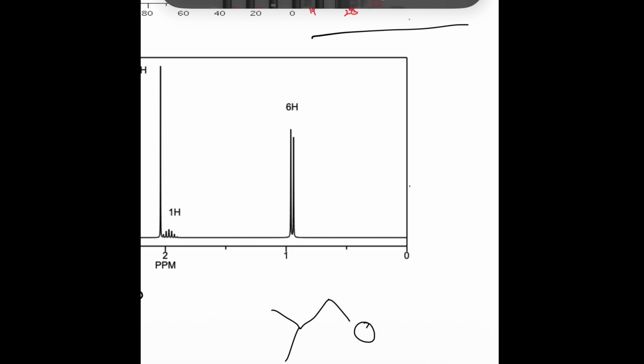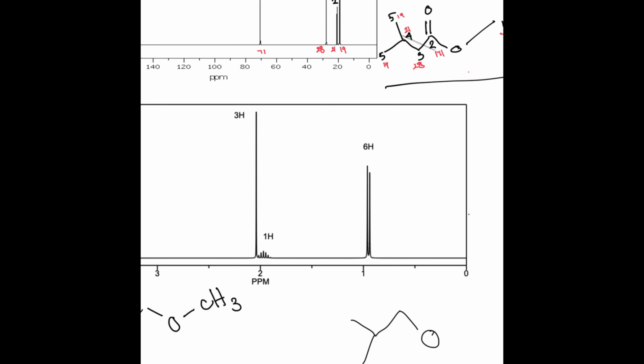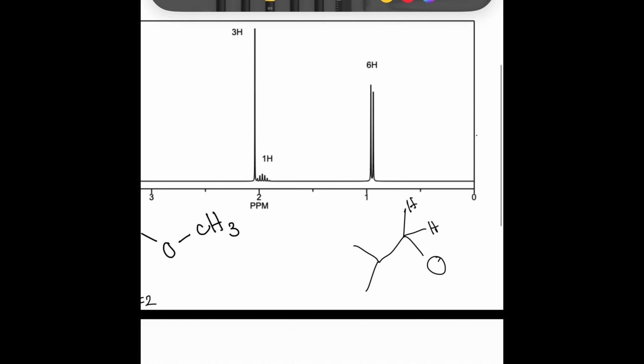That is kind of what we would need to see. So this type of group is possible and would give us a doublet, this right here. So we know that this has to exist in our real structure. We know that we need this type of group in our final structure. We can now just complete this structure by attaching this carbon to 2 hydrogen atoms. This type of group would give us the doublet, so we know that this has to exist in our real structure.